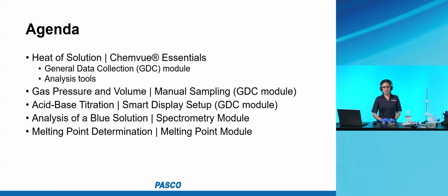And finally, I'll wind up with the melting point determination demonstration using the melting point module. So currently, there are these three modules in this version of Chemvue that's currently available. But in the future, there'll be more modules available.